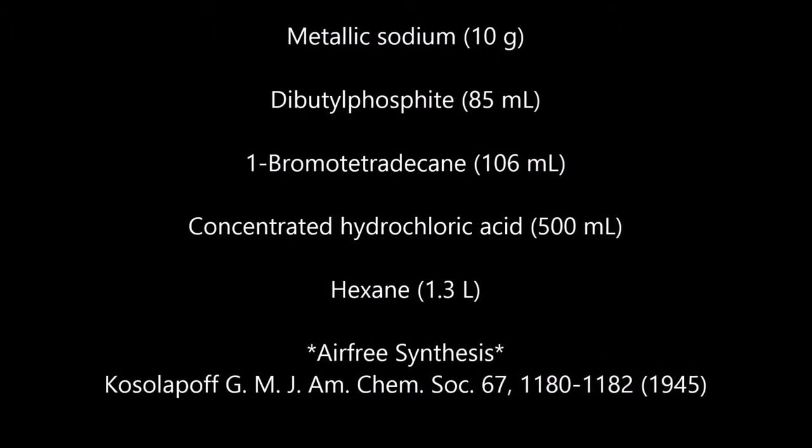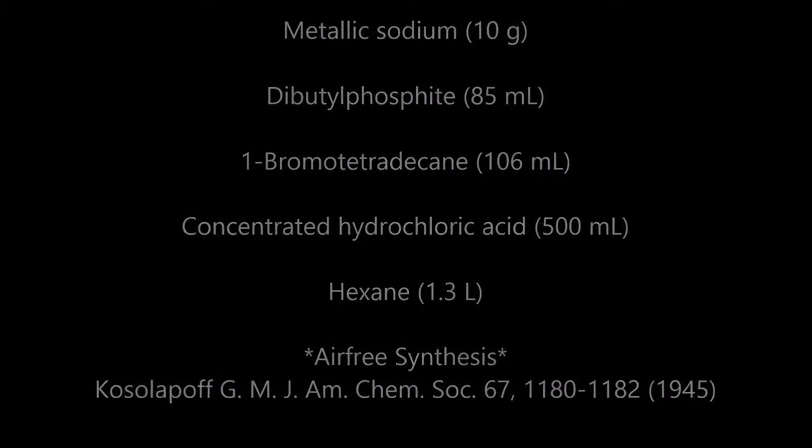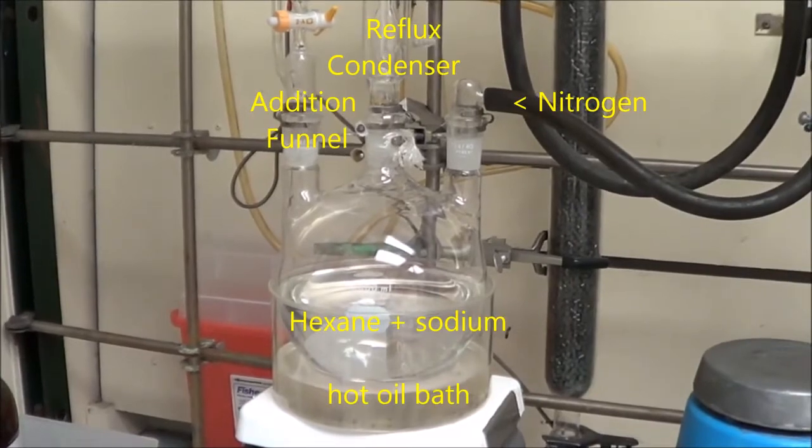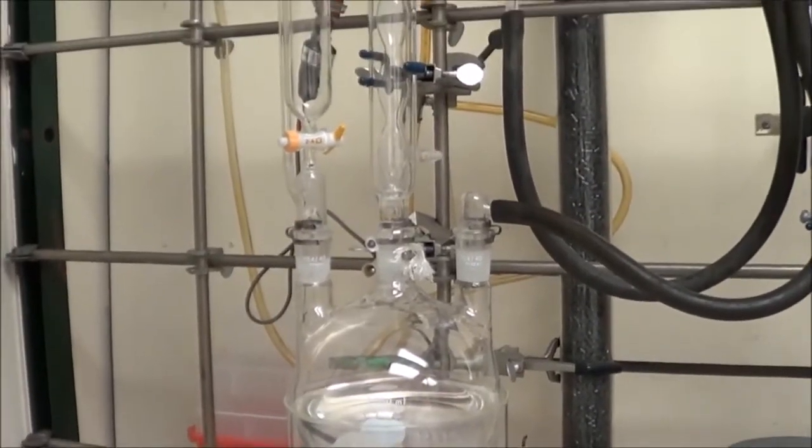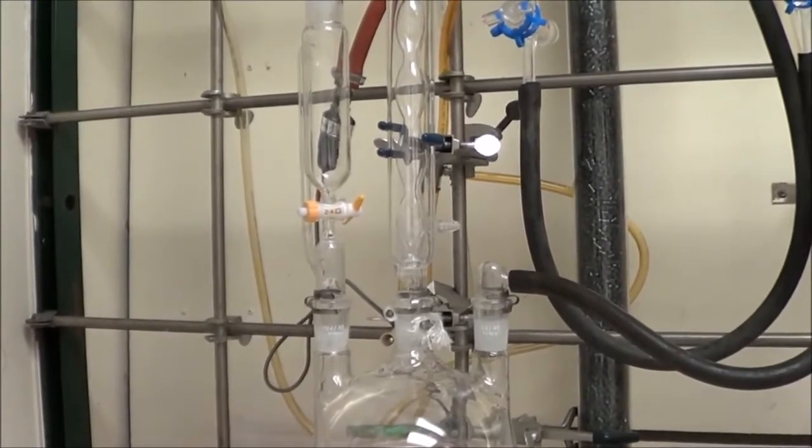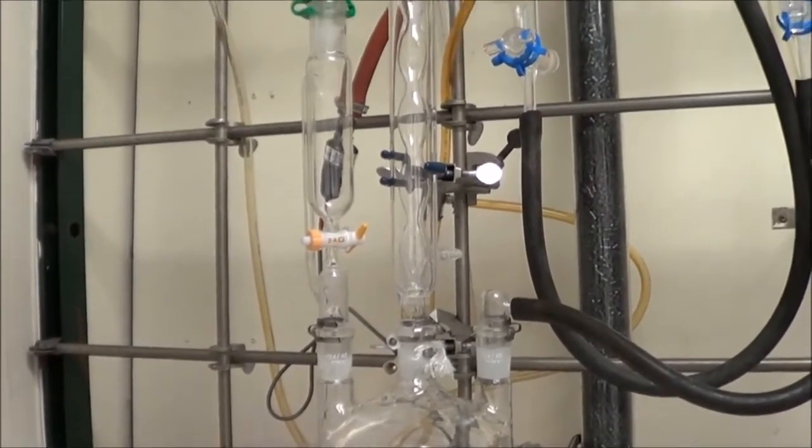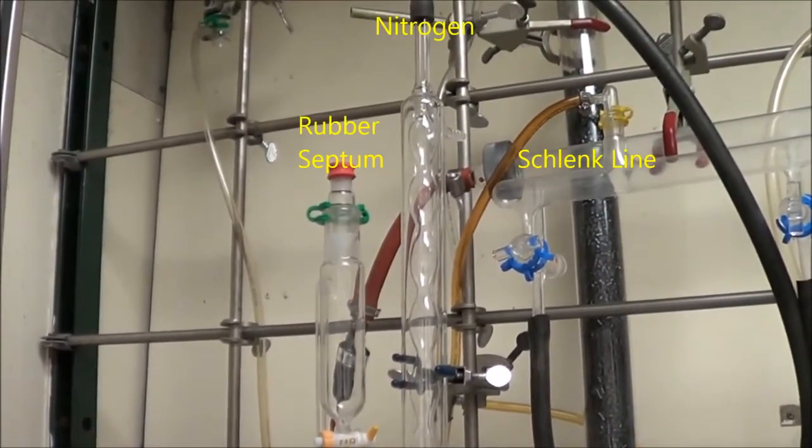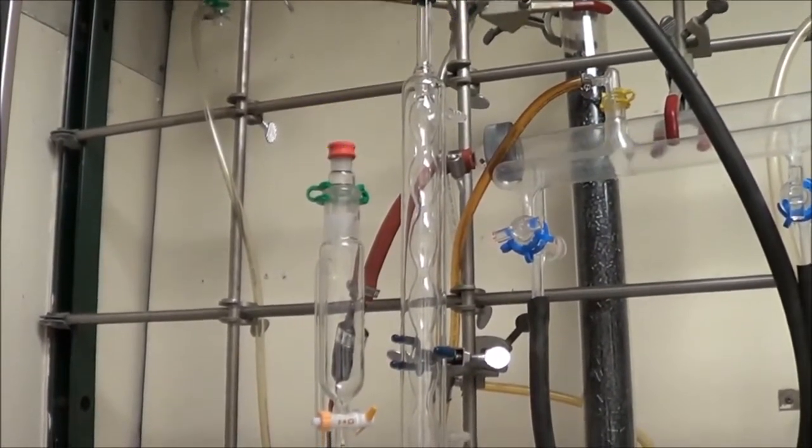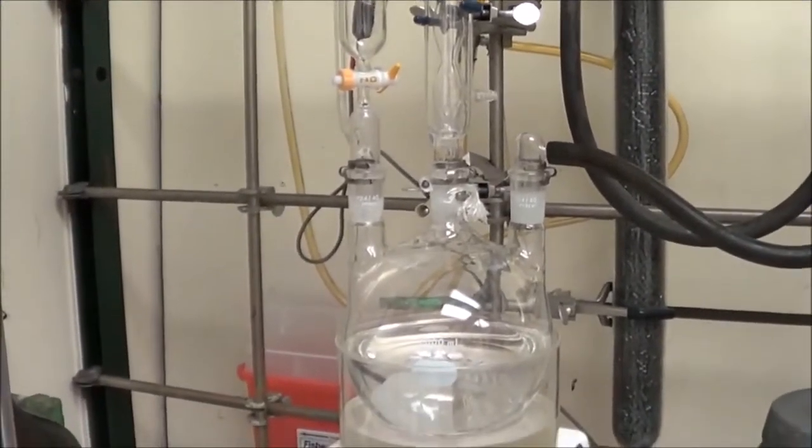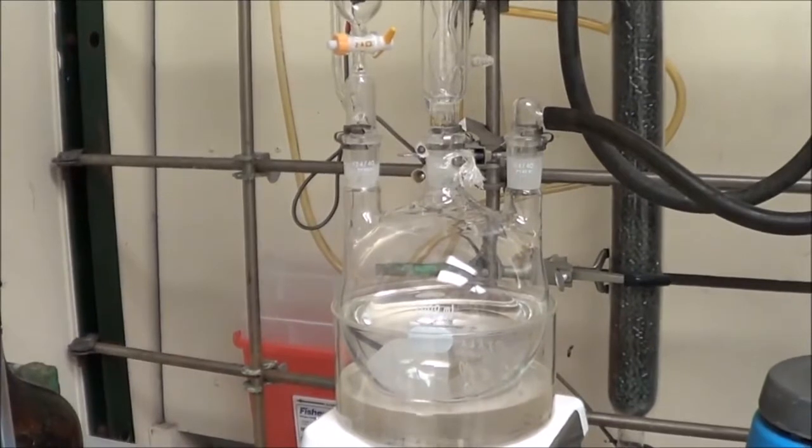We're going to use air-free techniques and air-free glassware. In the round bottom, we've already added the dry hexane and sodium cubes. We have an addition funnel, and the system's under nitrogen. We have a reflux condenser. We don't need to cool that with water because we're refluxing hexane, and air will cool it well enough. The whole system is connected to a Schlenk line to provide dry oxygen-free nitrogen gas.